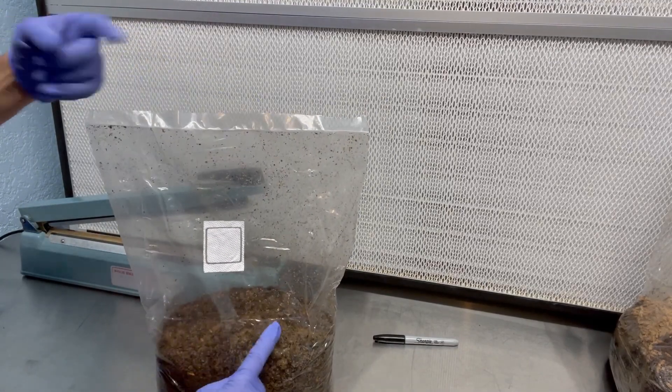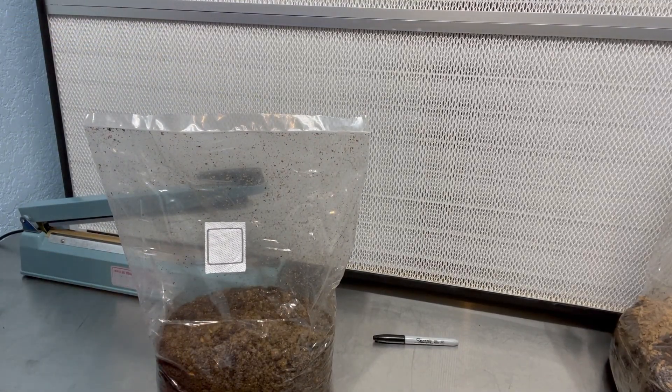It also keeps that block nice and dense so the mycelium can colonize quickly and healthy. Right above the substrate is very clean, and now it is going to go on the incubation rack so that the mycelium can grow out.